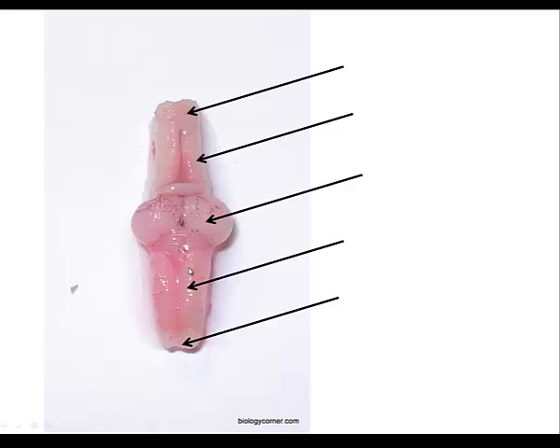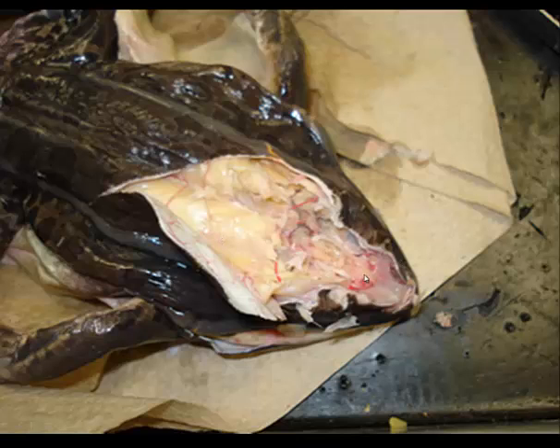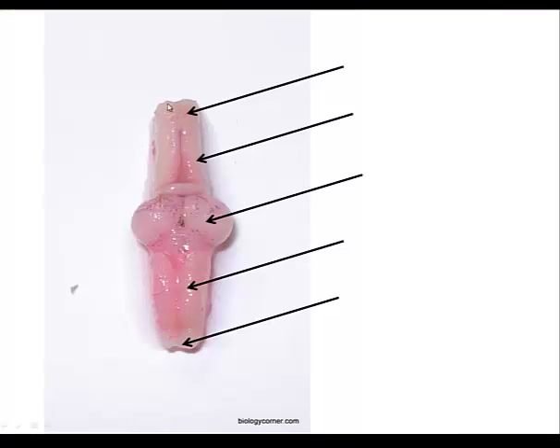Start with the most anterior portion of the head. Basically, we've pulled out the brain. In the most anterior region, there are olfactory nerves that connect to the nares and connect to the first portion of the brain, which is the olfactory lobe.